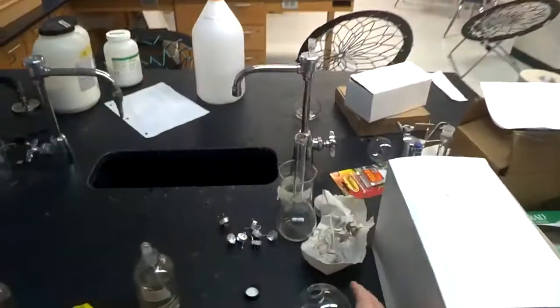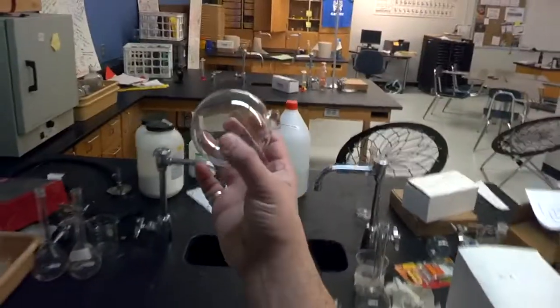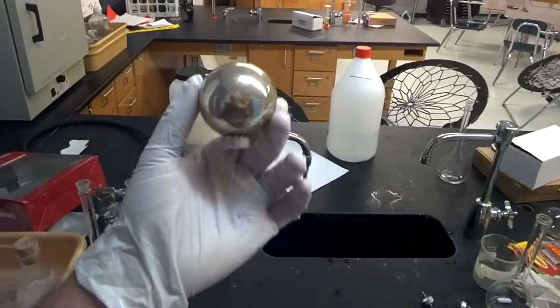So in this experiment what we're going to do is we're going to actually silver a glass ornament. So we're going to take this glass ornament and make it look something similar to this here.